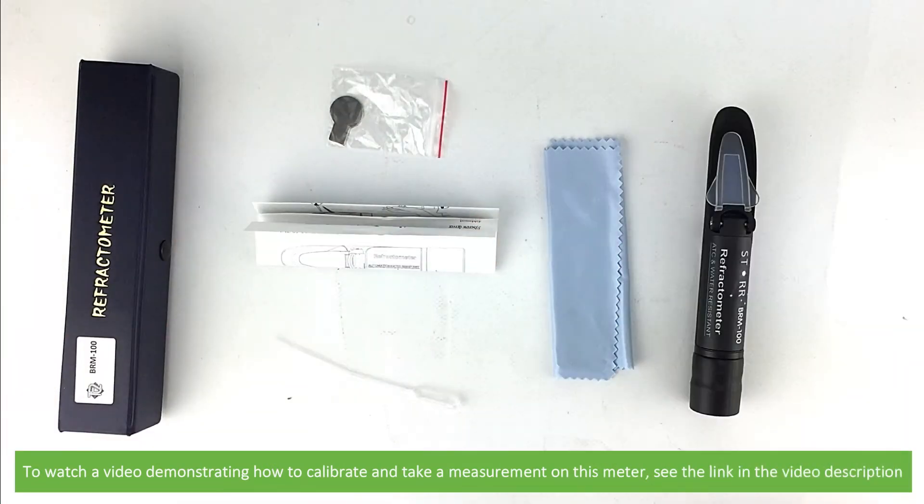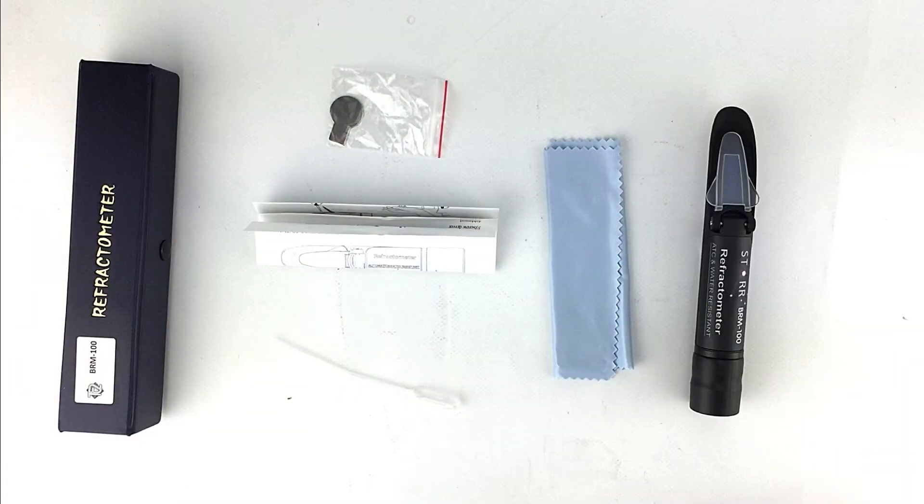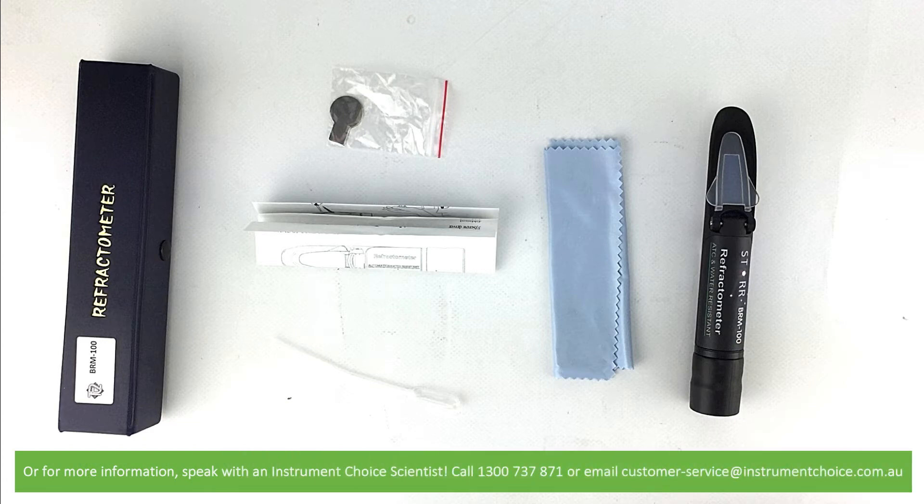To watch a video demonstrating how to calibrate and take a measurement on this meter, see the links in the video description. Or, for more information, speak with an Instrument Choice Scientist. Call 1300 737 871 or email customer-service at instrumentchoice.com.au.